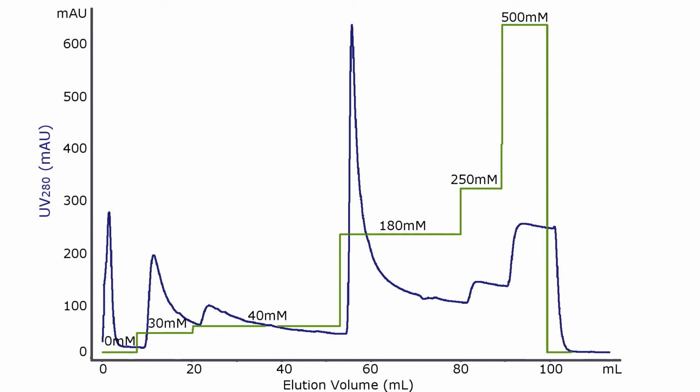Note that there are multiple increasing flat curves on the green line. This is a standard washing method called step gradient. As you can see, each time we increase the imidazole concentration, an absorbance peak follows shortly after. Once the peak tapers off and plateaus, the column has eluted all proteins with a certain binding strength according to the imidazole concentration. Also note that the new baseline is formed as buffer B concentration increases, since imidazole has absorbance as well.